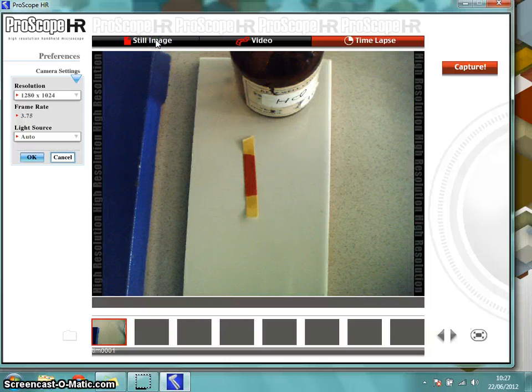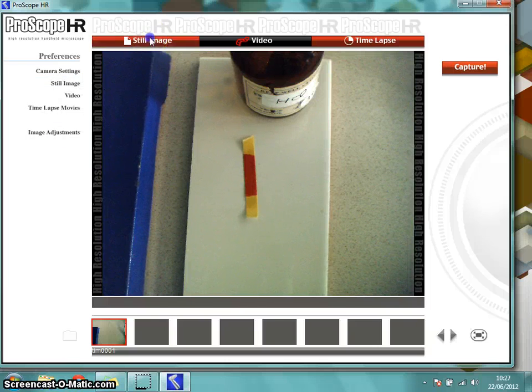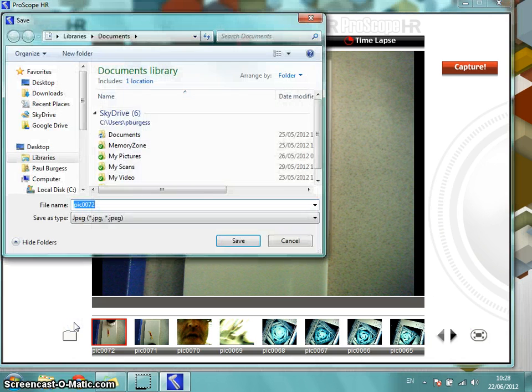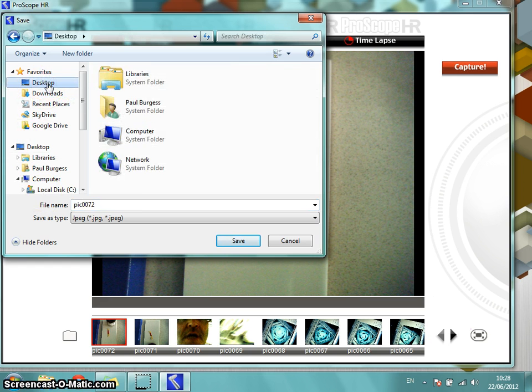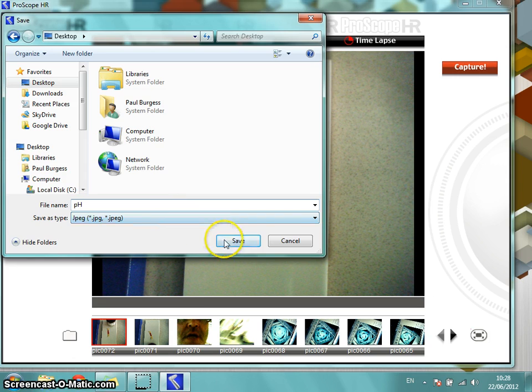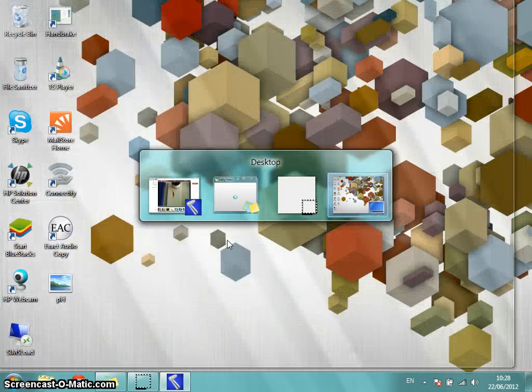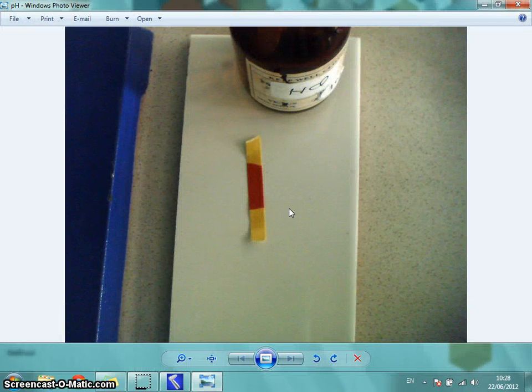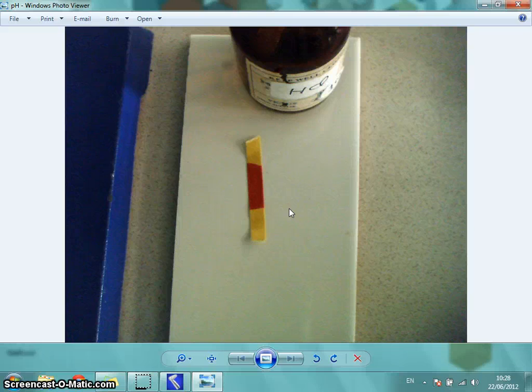If I go to Still Image here — here's the picture that I just took. There's a little folder here next to the pictures. You click Save As and then you can save the picture you've just taken. For demonstration purposes I'll save it to my desktop, I'll call it PH, and I'll save. Now going to my desktop, there is the image and I can use that however I want — open it up in another lesson, share it on the internet, post it on to the science department Facebook page, and so on.